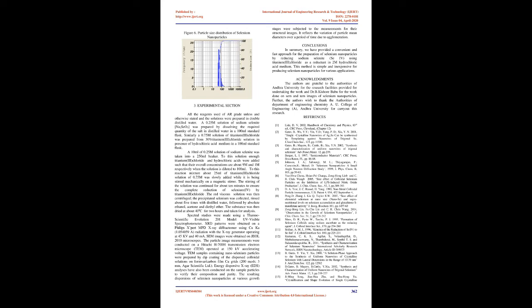The formation of selenium nanoparticles was verified by the corresponding SEM images presented in Figure 3. The selenium particles were found to be coarse and irregular but well separated. It is well accepted that the formation of crystals is mainly achieved through two stages, nucleation and growth. As soon as the reaction starts, a certain amount of t-Se seeds immediately precipitates out, i.e., nucleation, due to the reduced solubility of Se in the solution.